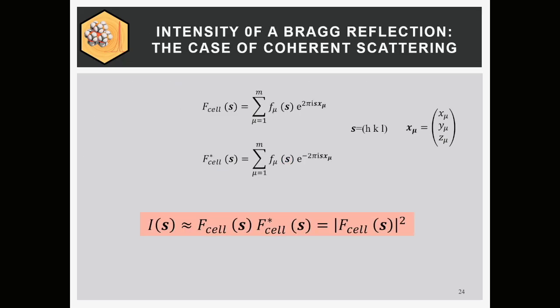All right. We also have seen, unfortunately, we don't measure the structure factor. The structure factor is the structure amplitude. And unfortunately, in the structure amplitude, in these little x mu here of the different atoms mu, you see there's the position of the atoms.